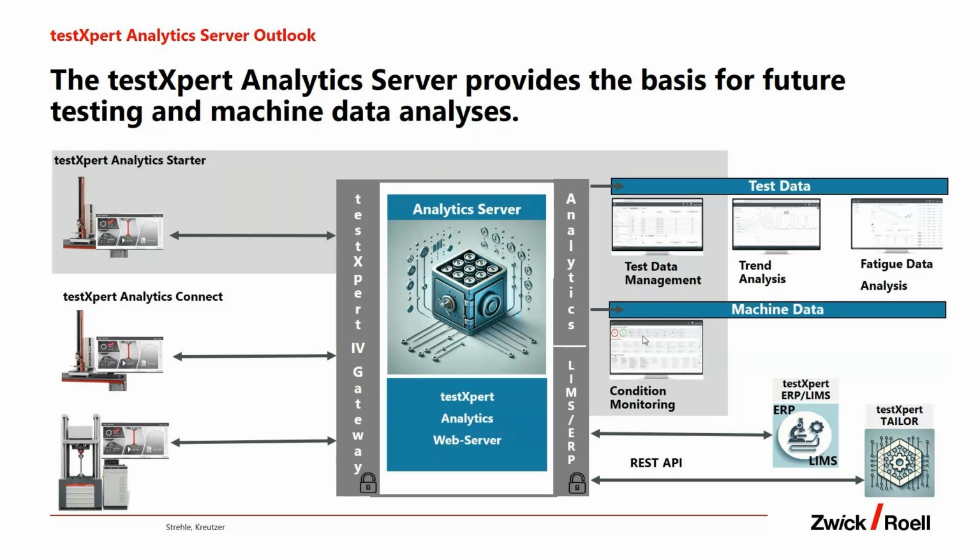And last but not least, we are still able to offer, let's say, a tailored, a customized solution if you need a special file format, or you have your own application on site, so that we can also connect it directly to this database. So it's up to you if you want to have quick and easy access via our web client tools, test data management, condition monitoring, or a customized connection to your ERP LIMS system as you wish.